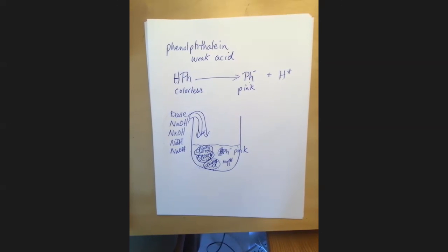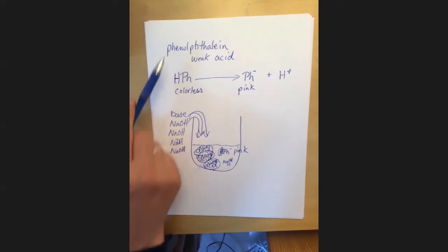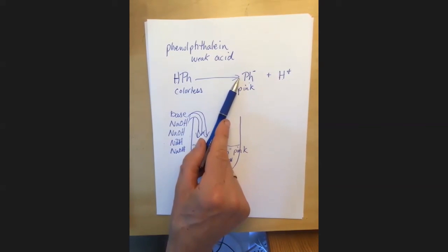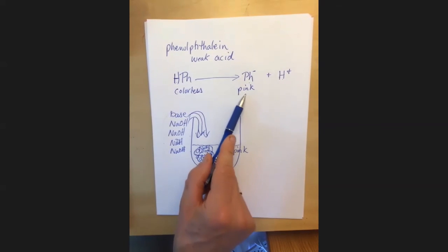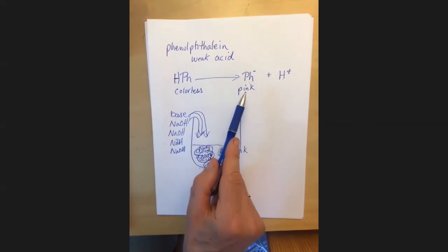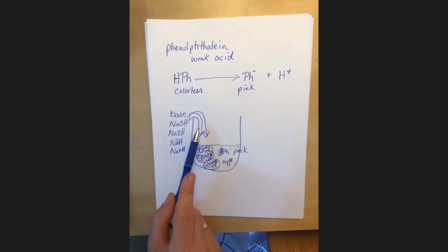Yeah, yeah. So the point of a titration is really to use a compound that we know a lot about to find out about a compound that we don't know so much about. And the thing that really made it easier for me when I began to really understand this was thinking about acid-base indicators are really weak acids and bases, and when the hydrogen is attached to the compound, it has one color or colorless, and when that hydrogen is removed, that's when the color changes. And so it's the first drop, the first few molecules in which you see those color changes, that tells you that's the point at which you can then use a little mathematics to figure out how much is present in the unknown compound.